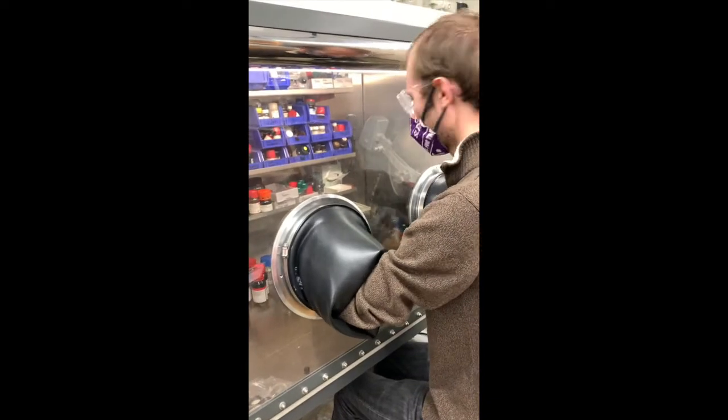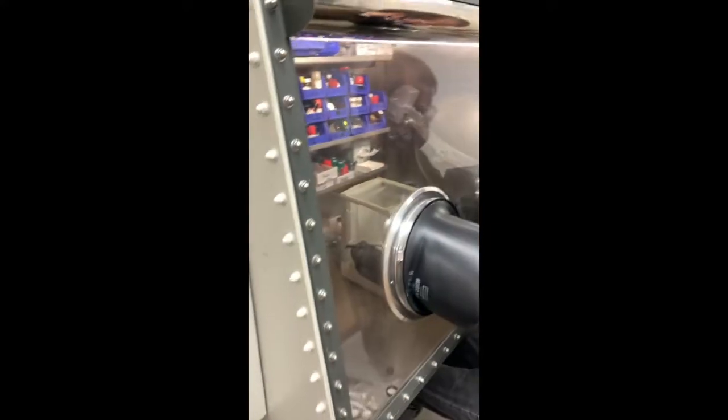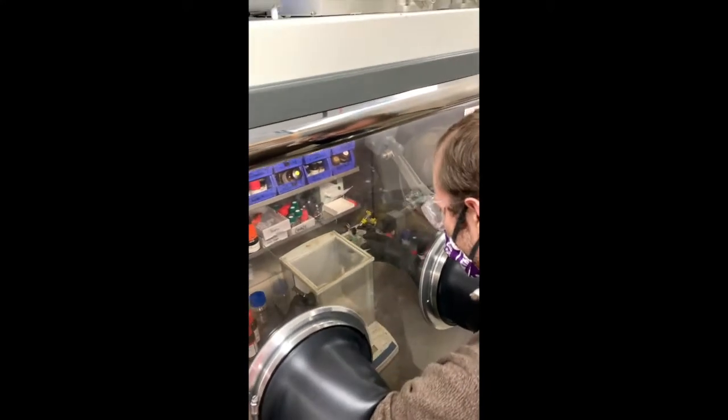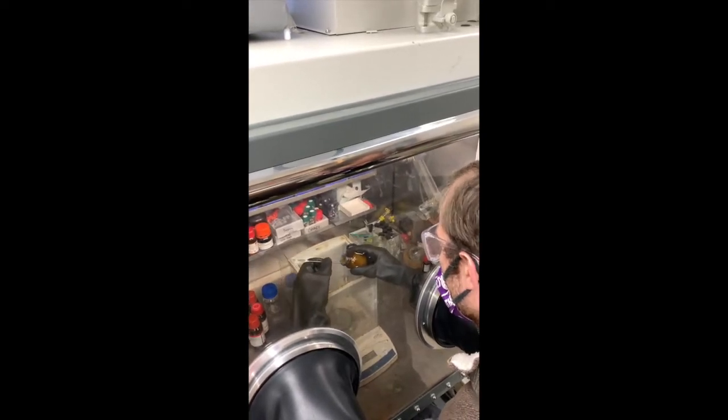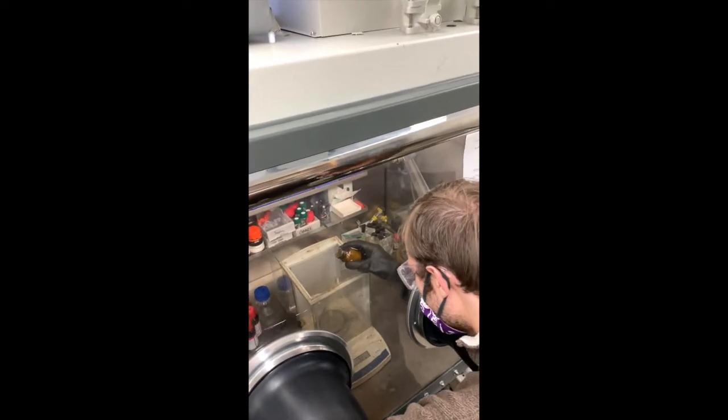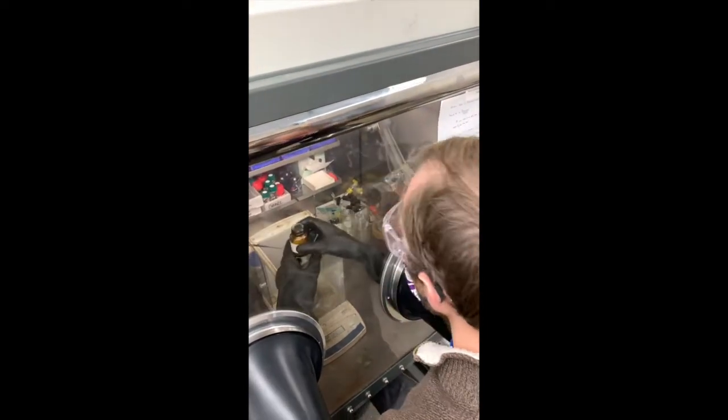So I'll grab a vial. We generally have a beaker of vials in here. Grab a vial, knock it over, put that on the balance. And today, I'm going to be getting some copper triflate. So I'll just weigh that out. Okay, perfect. 20 mg. That's exactly what I wanted.